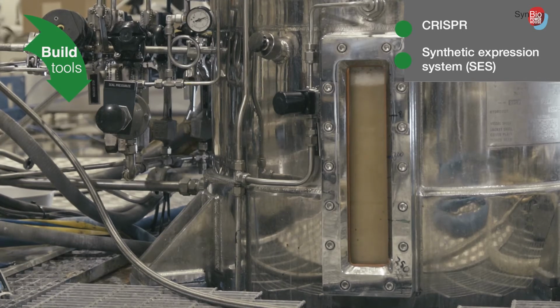The important thing with the SES system is that we can not only express at a very high level, but we can also tune the expression level, from very weak, gradually, to very high, higher than the strongest endogenous promoter. In addition, our experiments have shown that the SES system is very stable and maintains the expression levels also in bioreactor conditions. The set and designed expression levels are maintained throughout the bioprocess.